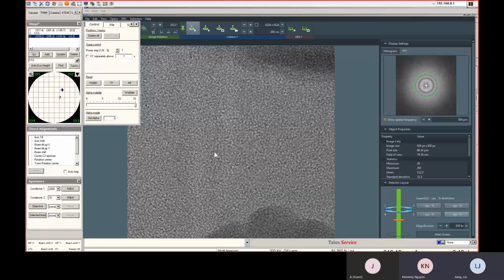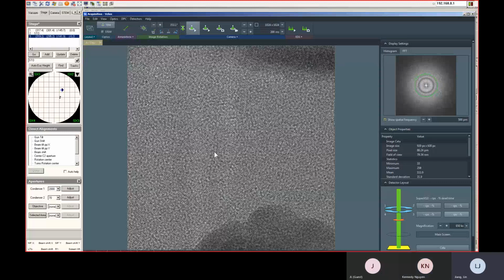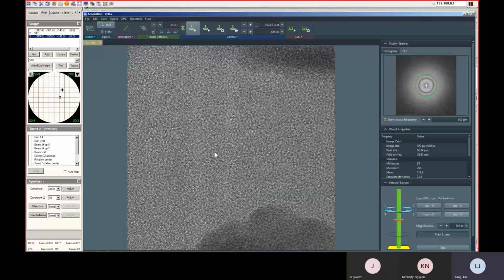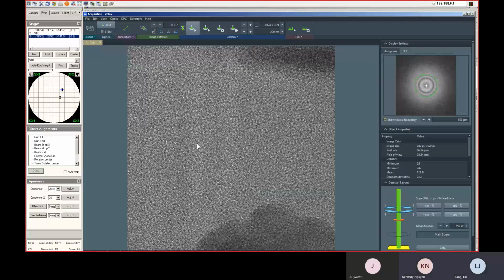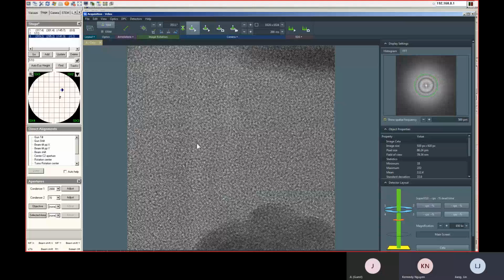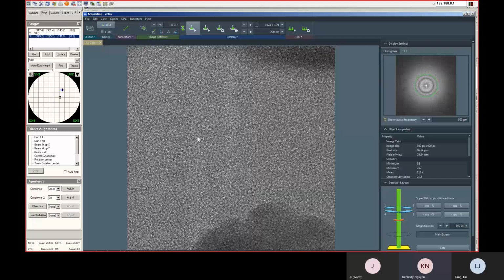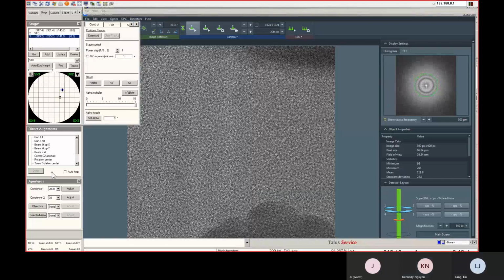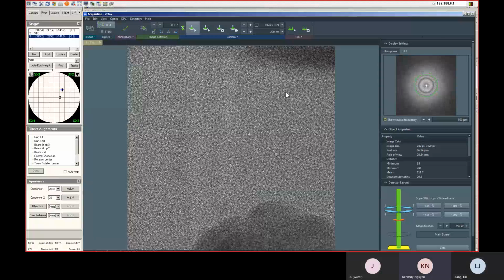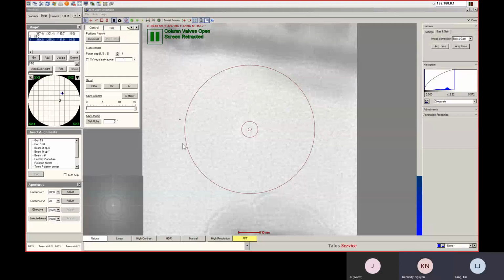Now we need to choose a location, right? So basically, you need to tilt your beam back to zone axis based on your Kikuchi pattern, right? Yes, but we already did that, so it should be good. Just for review, I guess we'll go over here. Is this embedded or something? No, let me do that. Okay, here. Load string.